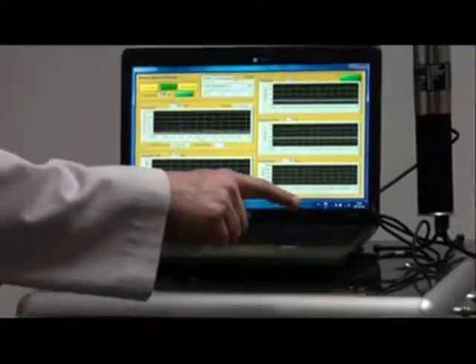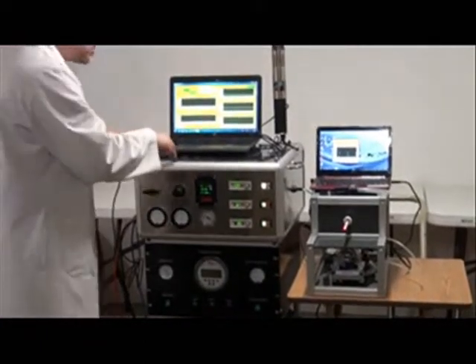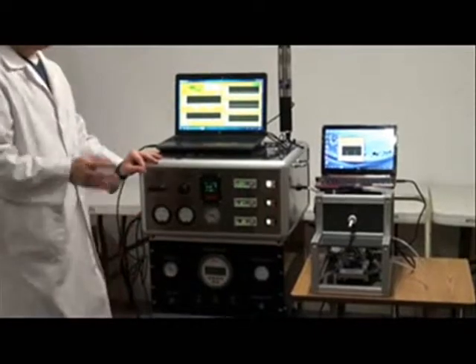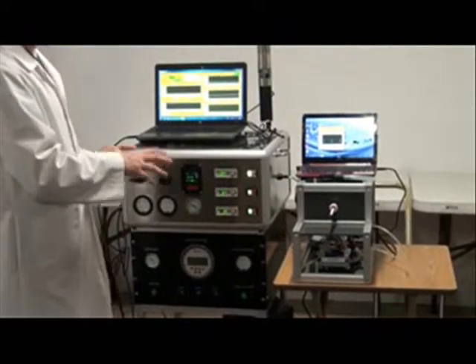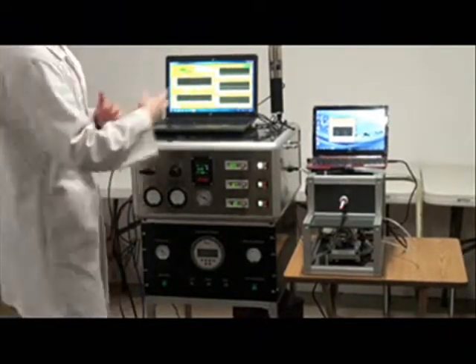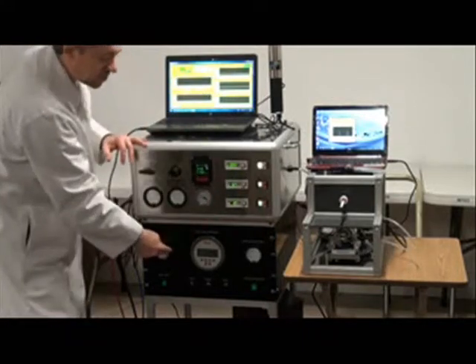This way, as long as the smoke machine is delivering that preset amount of smoke, the siphon is going to control the smoke in a steady way. And at the bottom of the siphon, we see another device, which is a mixer of side stream and mainstream smoke. This is a particular design for a large smoke generator, but also the seamless relay smoke machine. Here we can connect a module of side stream collection, which then can be mixed with the mainstream.